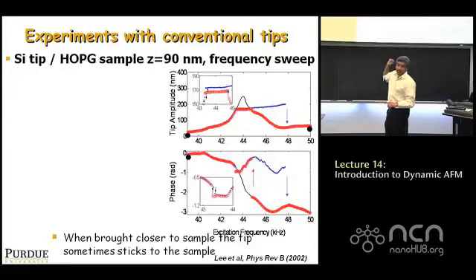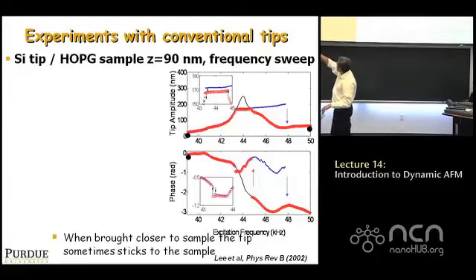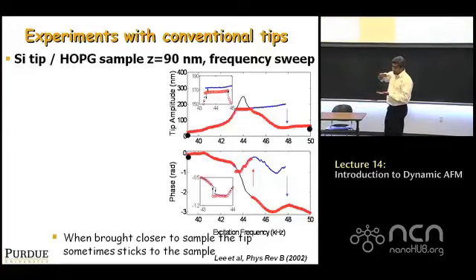It's acoustic, because on the left side the amplitude is low and on the right-hand side the amplitude is higher. So by looking at it, you can tell this is acoustic excitation. Of course, it's not perfect like theory; there are other things that happen. But the phase, just like I showed you, goes through 0 and goes through minus pi, or minus 180 degrees. However, that's the black.